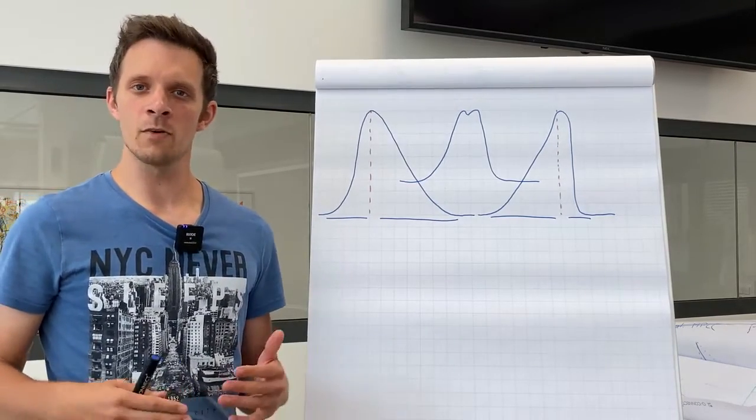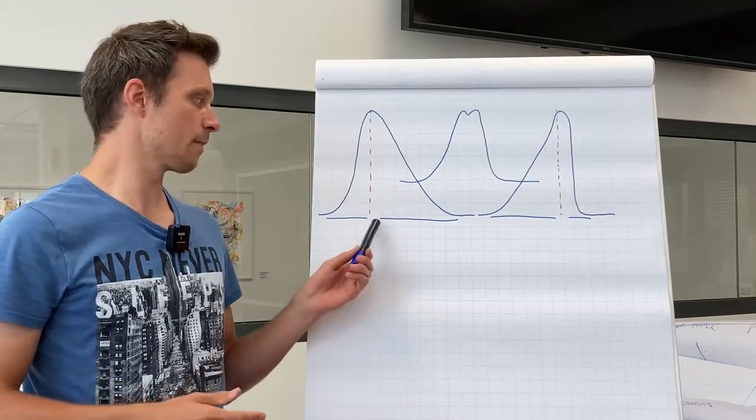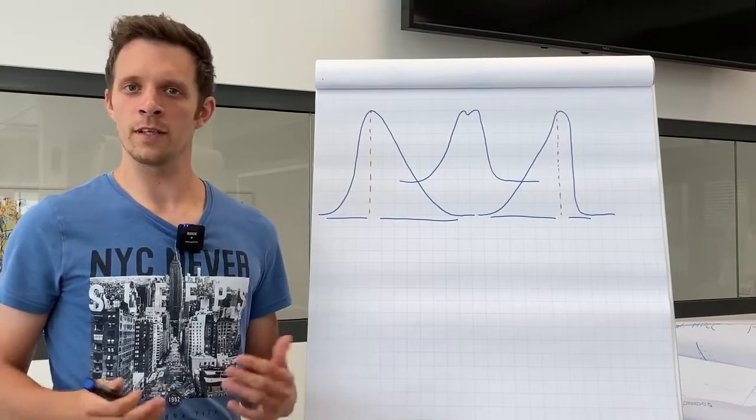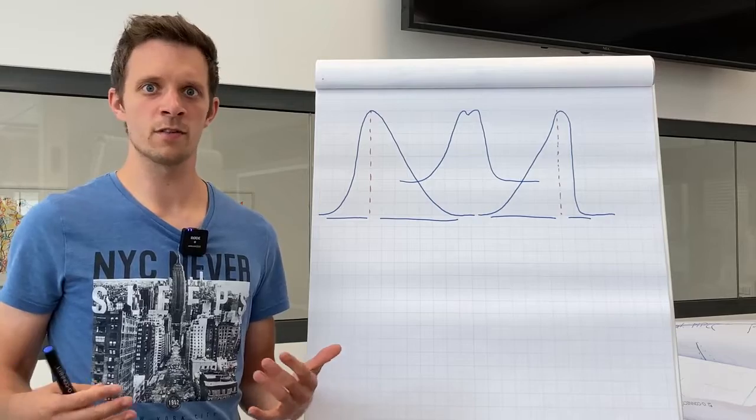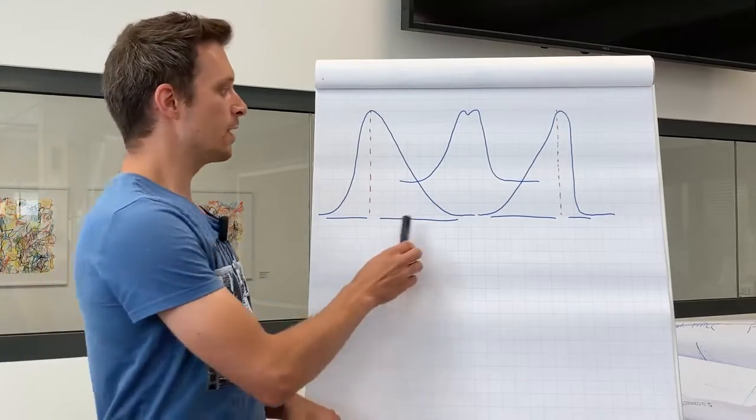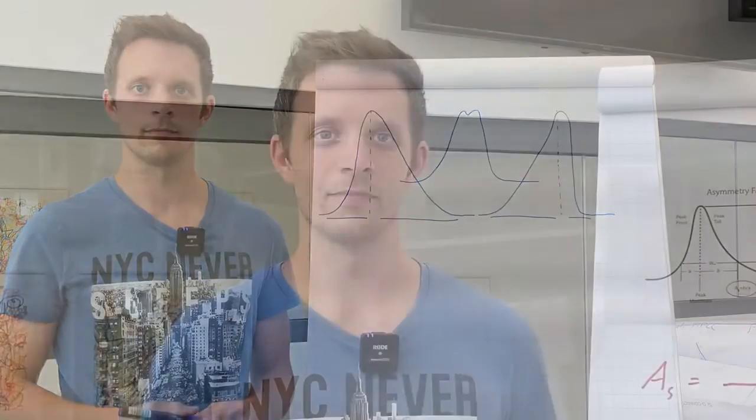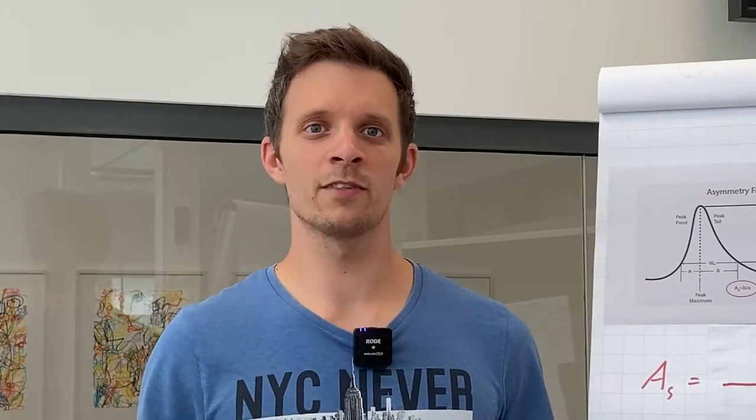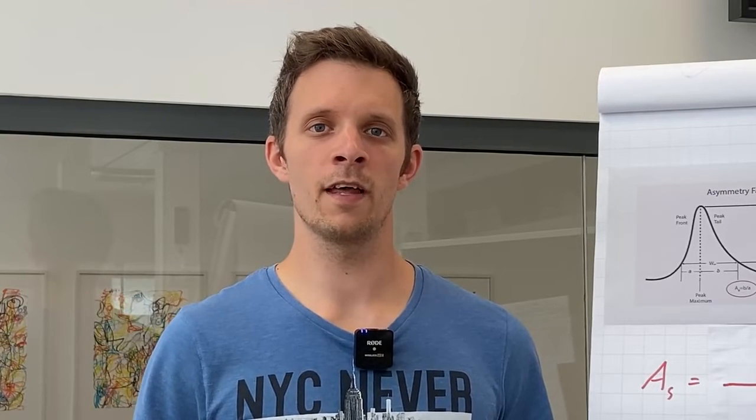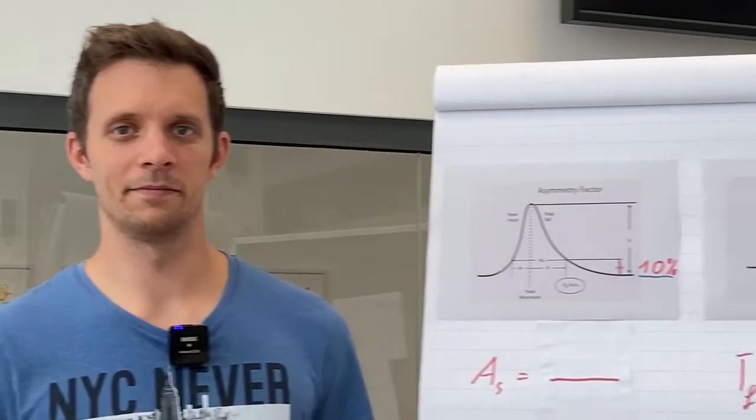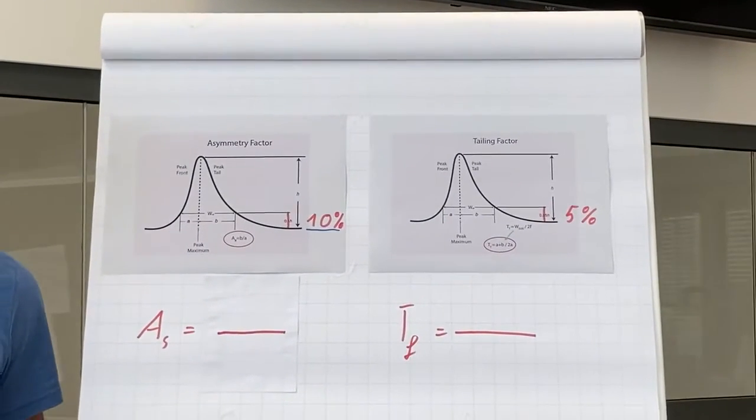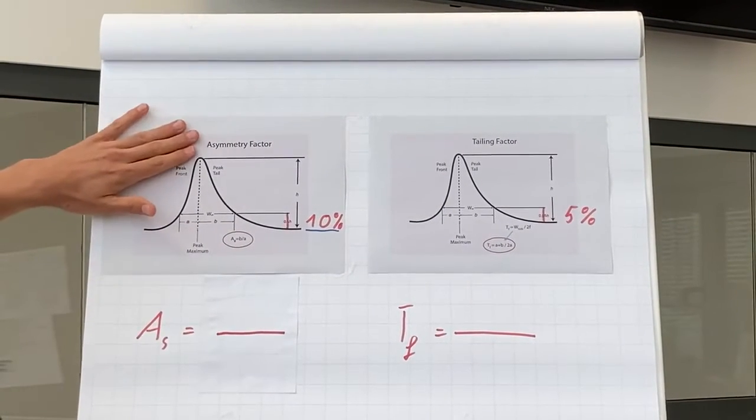But we can also calculate our peak shapes. This is important, for example, if you want to quantify your sample. Bad peak shapes can lead to incorrect results. There are two ways to calculate the peak shapes: the asymmetry factor and the tailing factor.